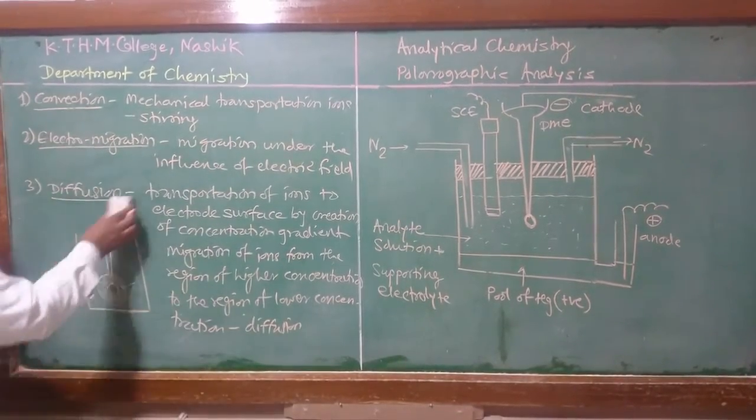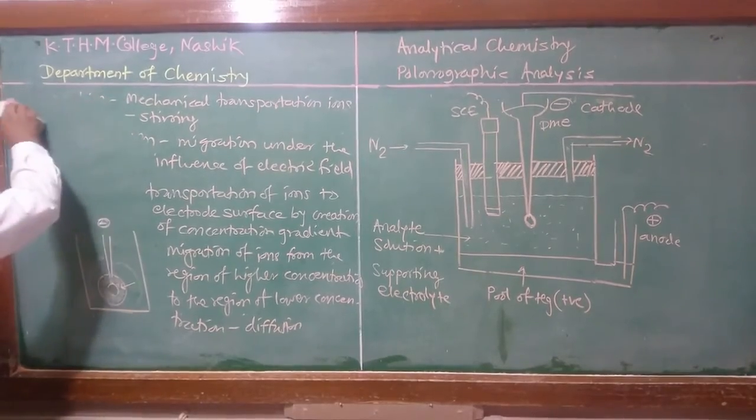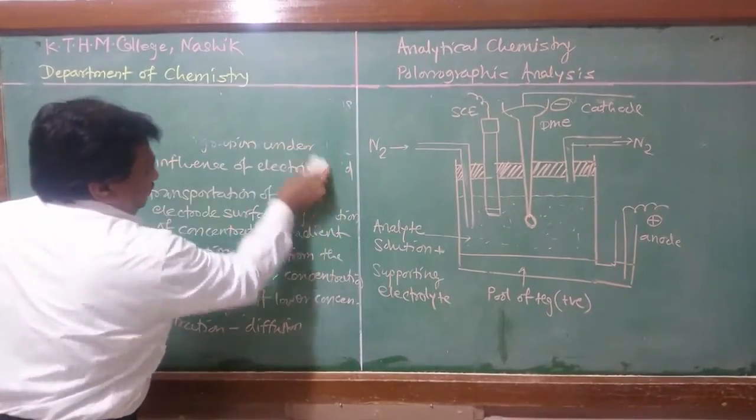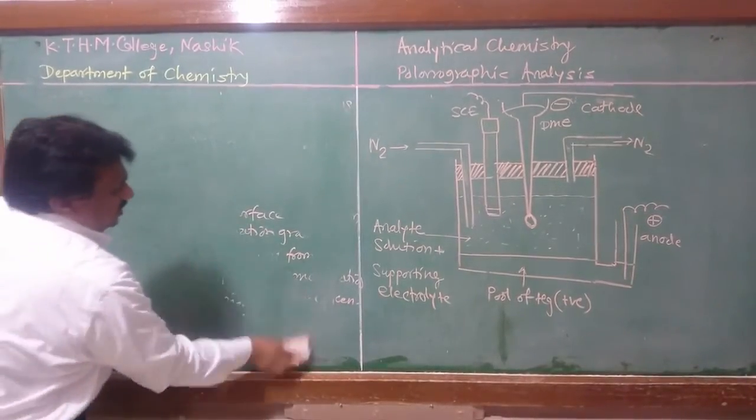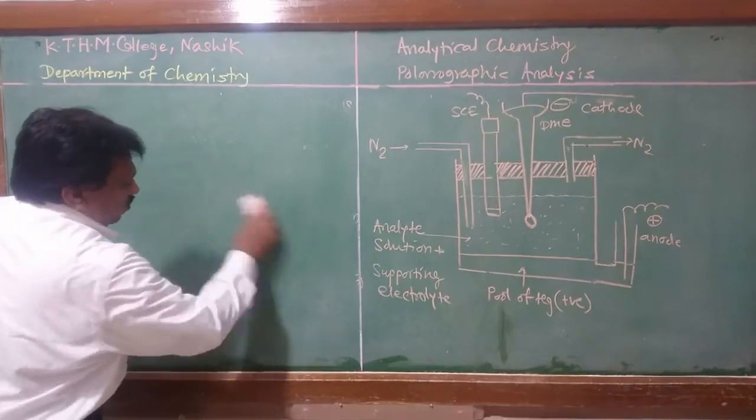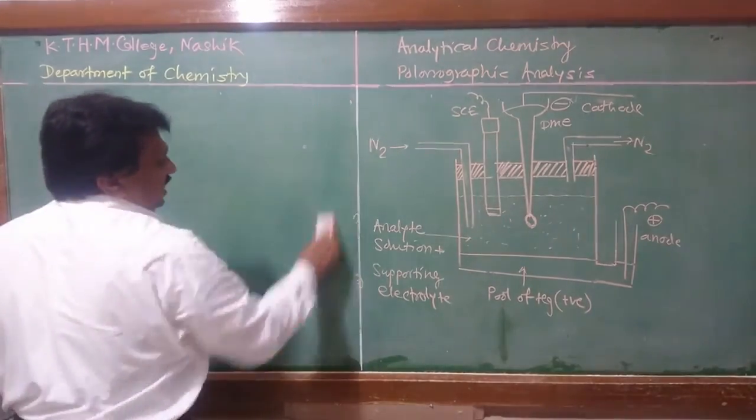Now we discuss how this transportation actually takes place. Suppose we linearly increase the potential between the working electrode and the counter electrode.